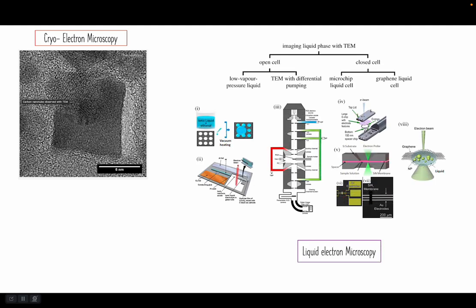The major challenge with microscopy, even up to recent years, was recreating the fuzzy 2D images as sharp 3D structures. A technique for generating a 3D structure of the protein at an atomic level using an electron microscope involves vitrification to cool the sample to cryogenic temperatures, thereby allowing the biomolecules to retain their shape in vacuum. This approach is called cryo-electron microscopy. This is the image of the birth of a carbon nanotube from a cobalt ferrite nanoparticle obtained using a Thermo Scientific cryo-TEM.